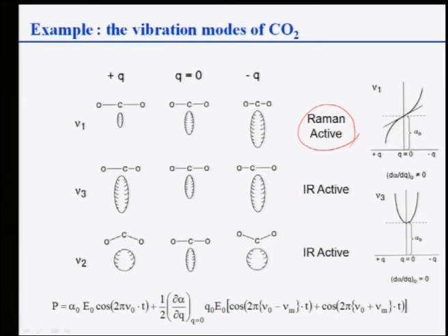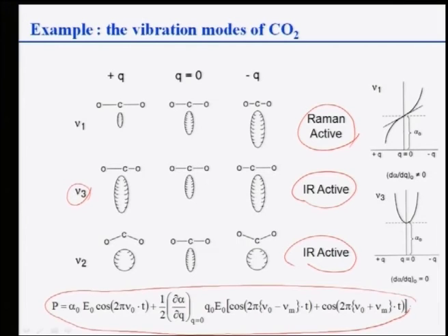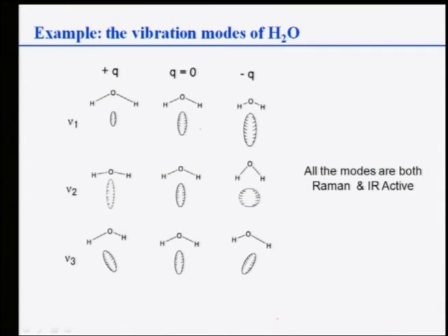But on the other hand, if there is no polarizability change, this is the band in which it happens, this will be IR active, which will not be Raman active. If the molecule is stretched or changes its configuration this way, this will also be IR active, and that can also show you the change in the frequency as a function of Q. Finally, again I have put down these equations where the Rayleigh, the elastic scattering, and inelastic scattering events are both given.